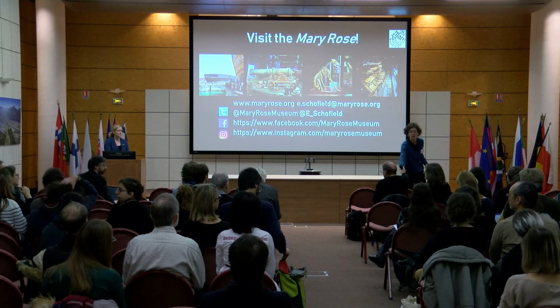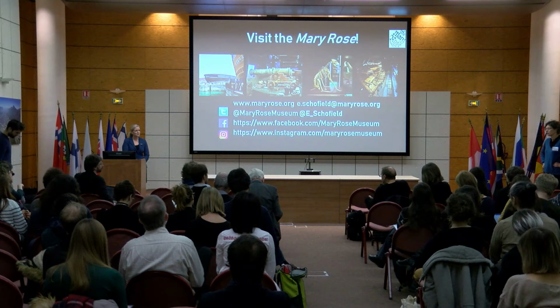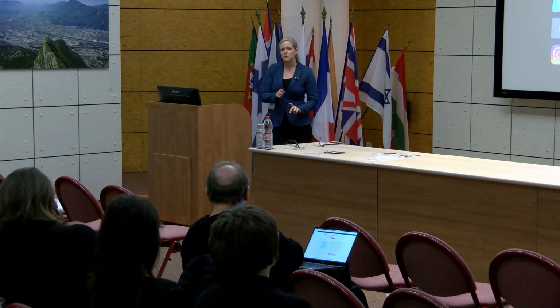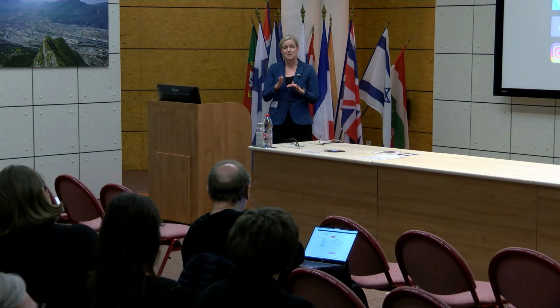So I think you mentioned this PDF activity at ID 15, I think it was. Could you elaborate a little bit on some details and maybe on constraints you have to respect to use that method, in terms of how small or how big samples can be? I'm not entirely sure of the size of the sample. We had very small samples, but I think there are bigger samples that you can fit in there. I don't know if Marco is here, actually, from the Beamline. I think maybe not. He would be able to answer your question much better than I can.